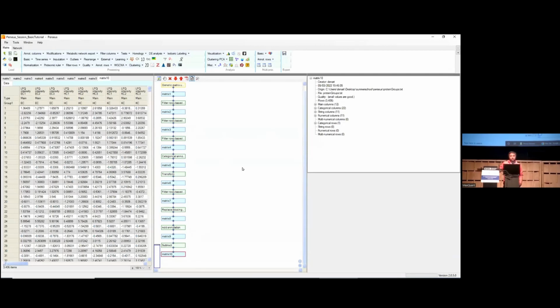Okay, so what are we going to do in this tutorial? The first part was data preprocessing and data cleaning, which is actually the most important part, because all your further analysis depends on it. And in this part, what we want to do is to answer biological questions. So we want to transform our data into information, into biological information, to be precise.